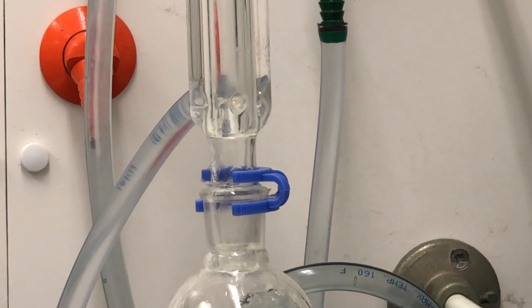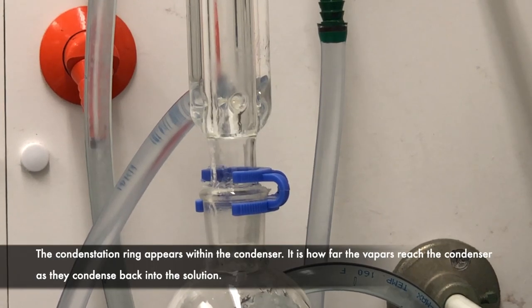You may have noticed the formation of condensation right here and how the condensation is now also going up onto the sides of the condenser. So we can go ahead and start our time of reflux.